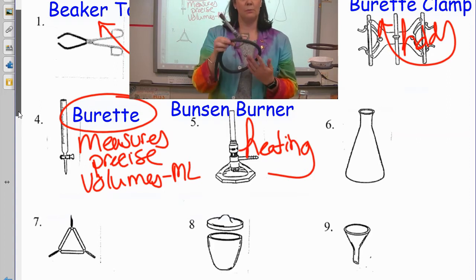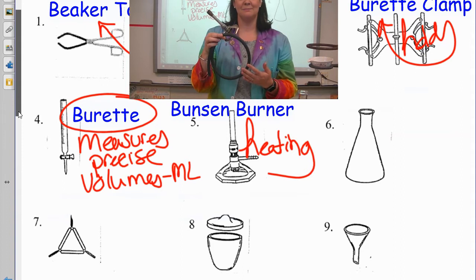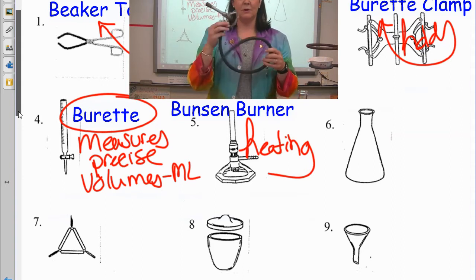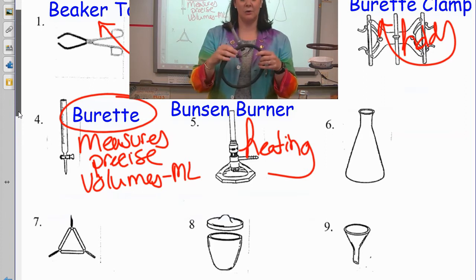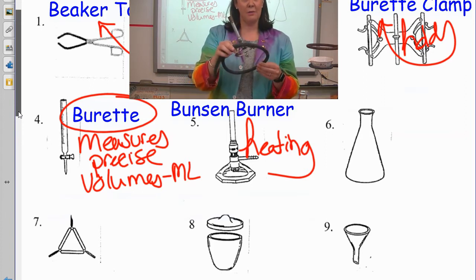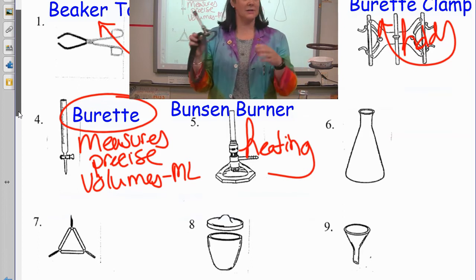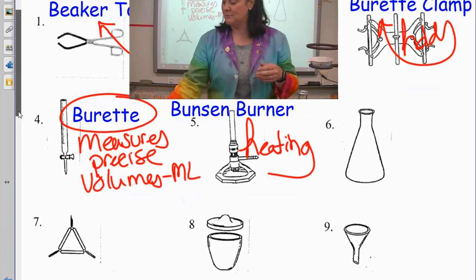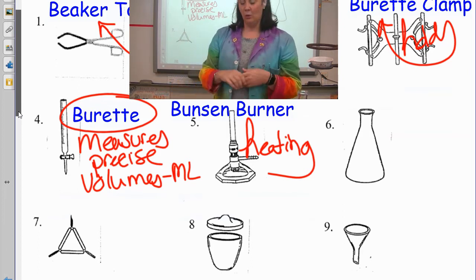Just a side note, it burns methane gas. This is a Bunsen burner. Just a side note, this burns methane gas that comes out of our gas valves around the room. So we'll talk more about Bunsen burners next week.